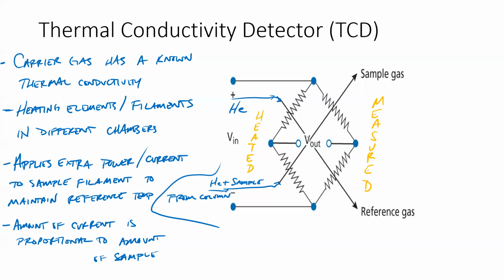To the best of my knowledge, and I'm not hugely familiar with these kinds of detectors, they don't give molecular information. The emission ones can give sort of atomic elemental information, but they don't give you very good molecular information. Of course, none of this really gives us very good molecular information.